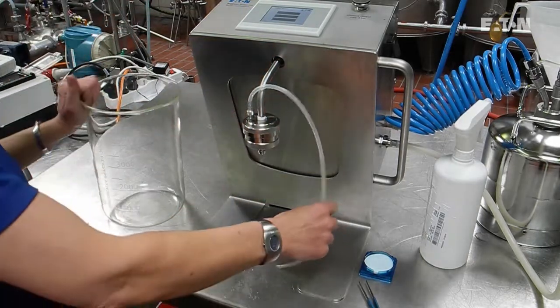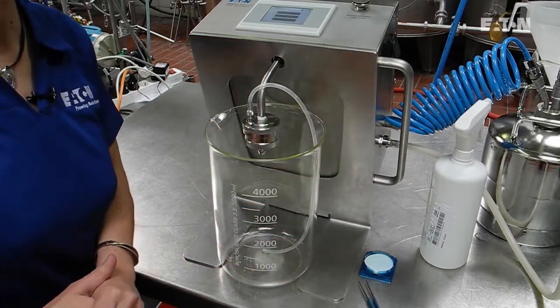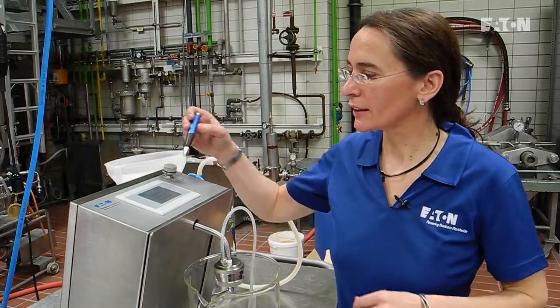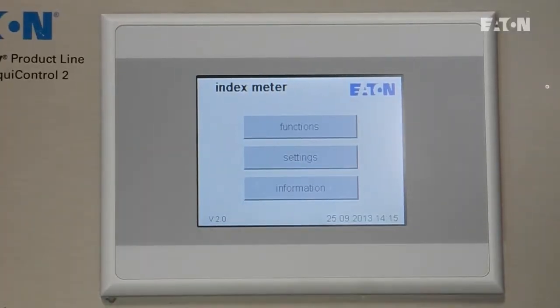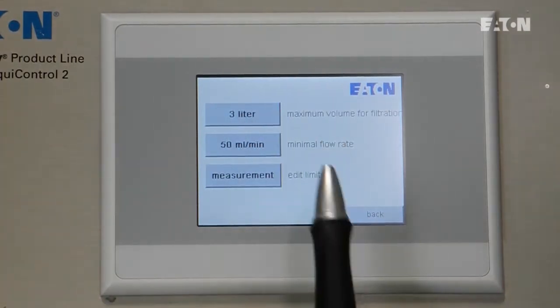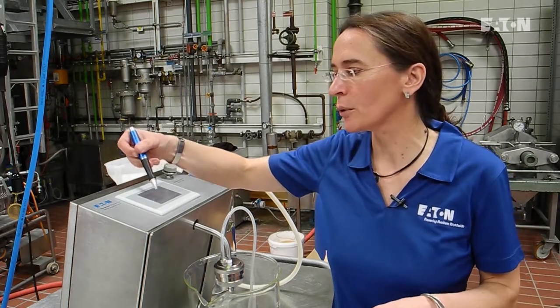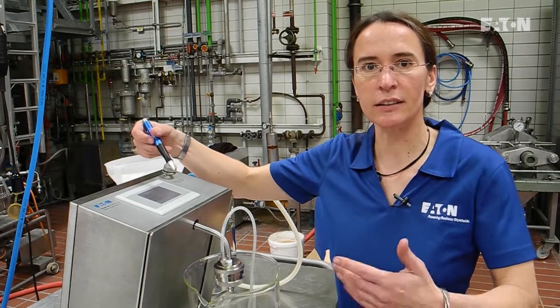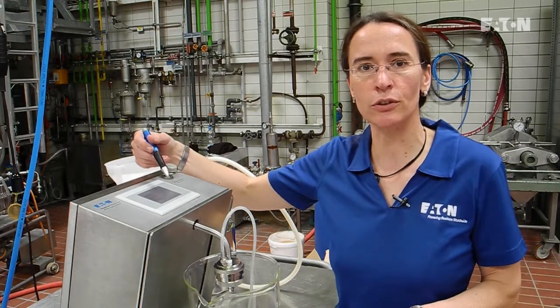We have prepared everything perfectly. We put in the glass, and we can now start to define the parameters of the filter index measurement unit. We will program the equipment, and there are three different parameters. We have to define the maximum volume of filtration — in our case it's three liters. We have to define the minimal flow rate, which is 50 milliliters per minute, and we measure to the set limits, meaning everything in the storage tank.